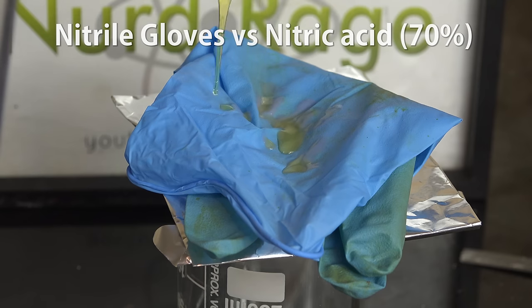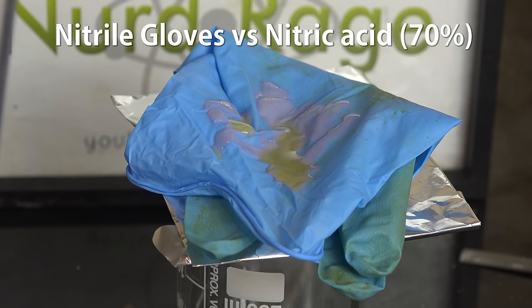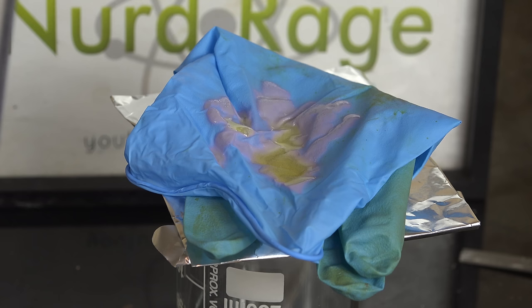Here I have my nitrile gloves and I'm dropping on concentrated azeotropic nitric acid of 70% concentration. This is the most common concentration available for nitric acid and the concentration produced when fractionally distilling nitric acid. As you can see it does damage the gloves but does not set them on fire. As usual, gloves rarely provide total protection, but instead provide resistance and time. As soon as you spill something damaging on your gloves you're supposed to stop and change your gloves. The chemical resistance of the gloves gives you time to do so. Concentrated nitric acid is destroying these gloves but I would have had several good seconds to change them before they start soaking through.